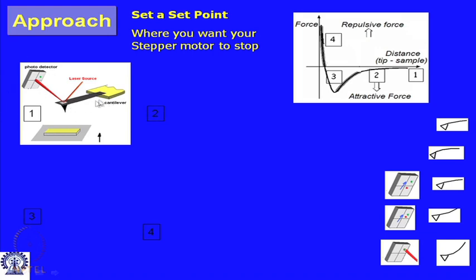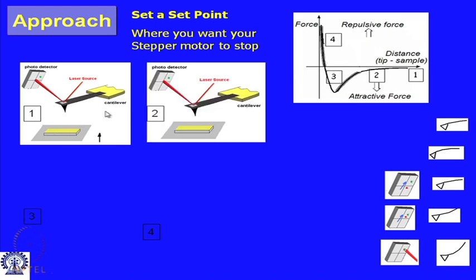This is an aligned AFM, and the sample surface is far away. The stepper motor takes care of giving a vertical movement to either the sample. You either bring the sample close to the tip, or you bring that whole assembly close to the sample. It works either way, it is the same. So, it starts to move, and two things are important here. The first is what happens during the sequence of movement, and the second, the question that should immediately come to your mind: I am giving a vertical motion, but when do we stop? We will talk about this.